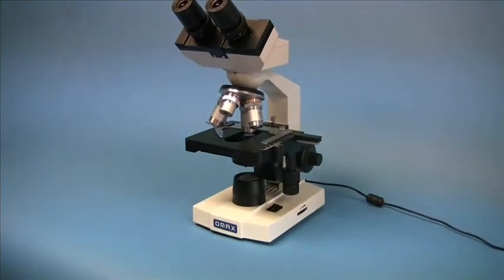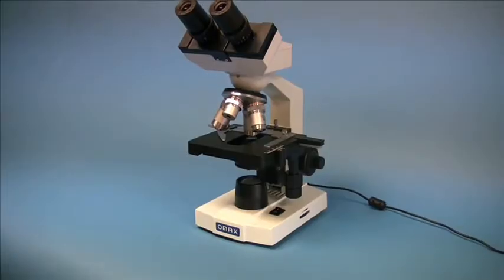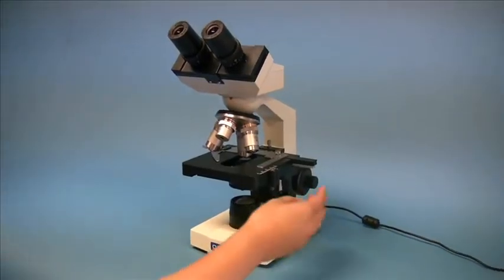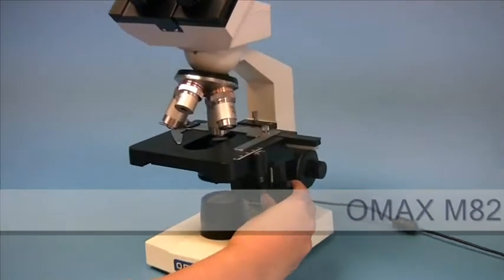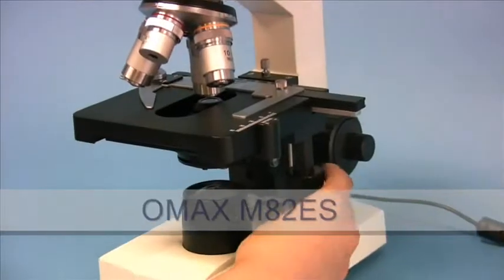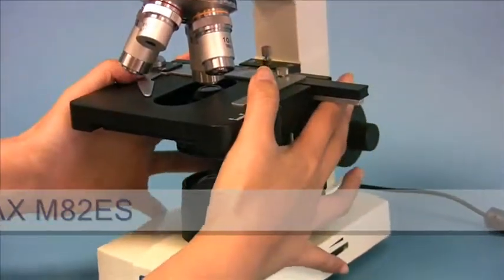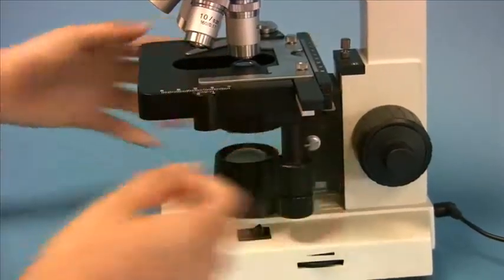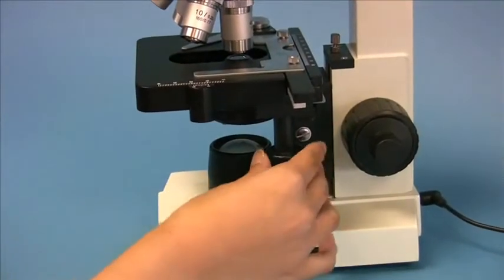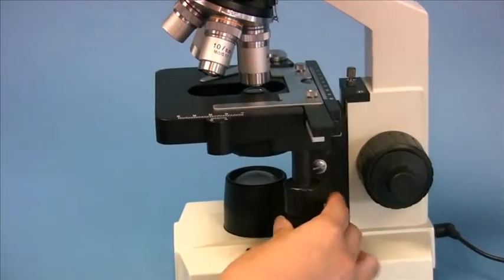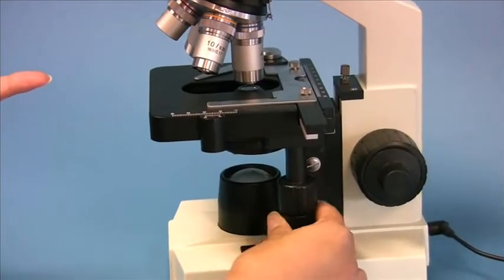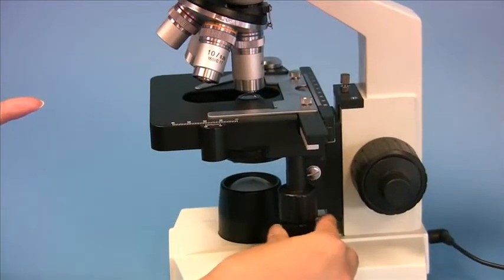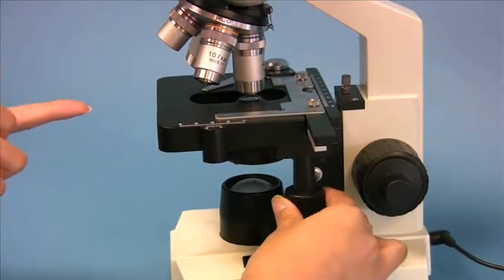This model also has some distinct features of its own. First, it has a double layer mechanical stage. So let me just turn it a little bit to give you a better view. The adjustment knobs can move the stage in the X direction and in the Y direction.